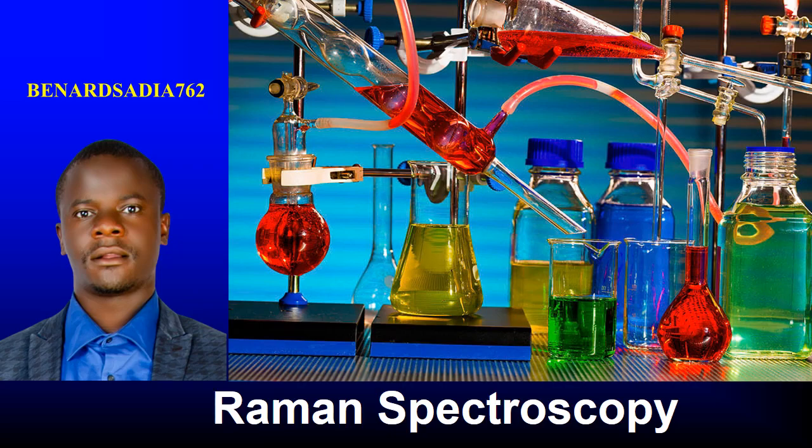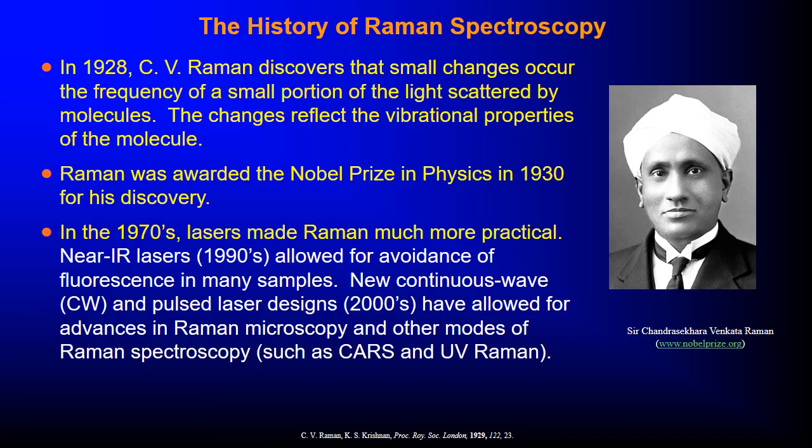Today we want to talk about Raman spectroscopy. In 1928, Raman discovers that small changes occur in the frequency of a small portion of light scattered by molecules. The changes reflect the vibrational properties of the molecule. Raman was awarded for this Nobel discovery in 1930.